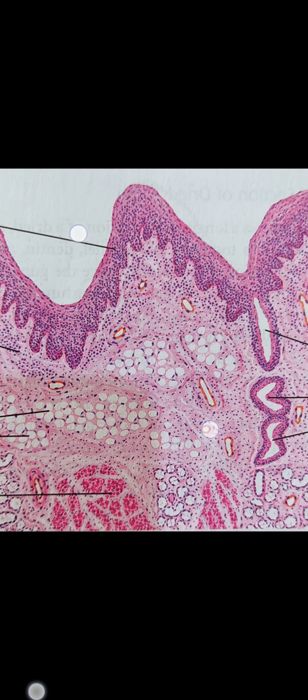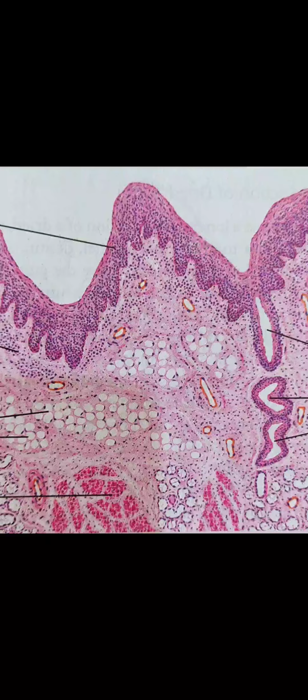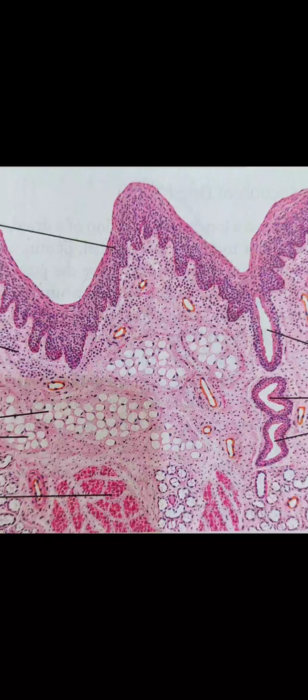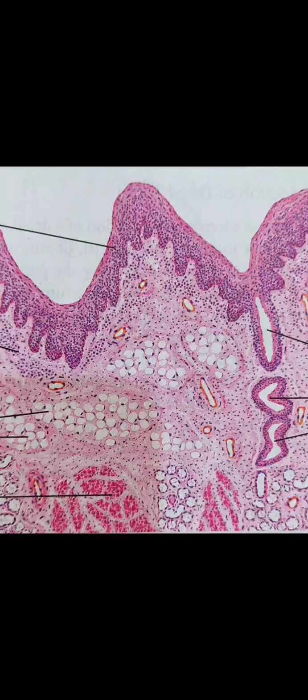The lamina propria of the mucosa is wider but similar to that of the anterior 2/3 of the tongue. Under the stratified squamous epithelium are seen aggregates of diffuse lymphatic tissue, and accumulation of adipose tissue, nerve fibers, blood vessels.